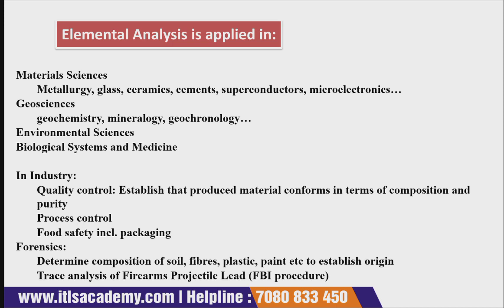Now how is it useful in geosciences? For example, geochemistry, mineralogy, geochronology. It is not concerned with any one particular industry, it is concerned with every industry, whether it's a geological analysis or related to any biological analysis. Everywhere elemental analysis plays a very vital role.